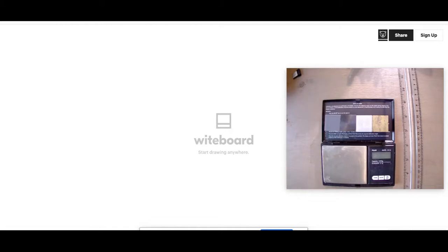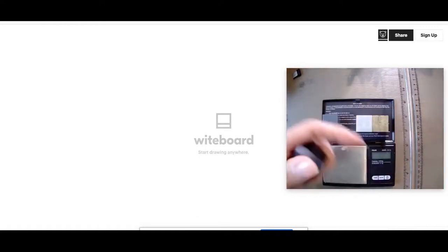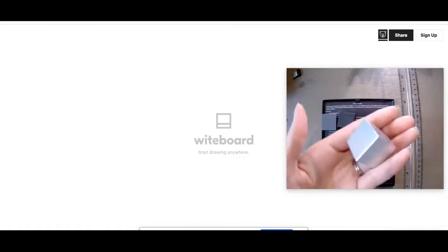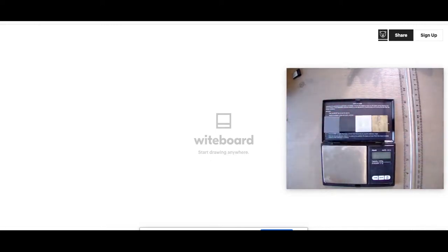So now let's look at an example of how to measure density in practice or in the lab. So here you can see I have 4 different cubes. Some of them look pretty similar. Some of them look a little bit different. One thing that you might right off the bat notice about the cubes as I have them sitting is that they all are exactly the same size.